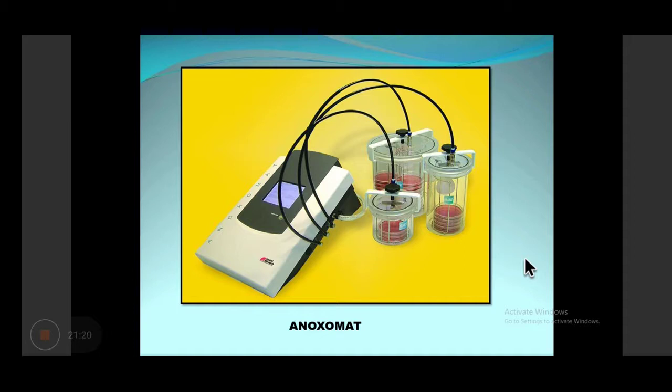If present, the anaerobic condition was not maintained. So the presence of aerobes determines whether the anaerobic condition is maintained or not.